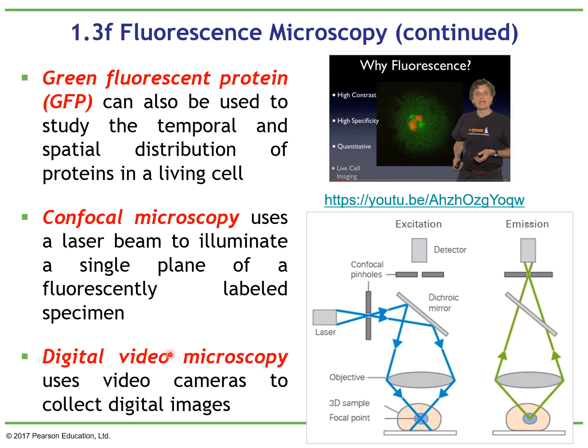Finally, as I said before, this picture will take a long time. You're going to have to scan one section in the x-axis, so it goes in one direction, then it goes in the other direction. You can see this can take minutes, and then you can go also in the z-axis.